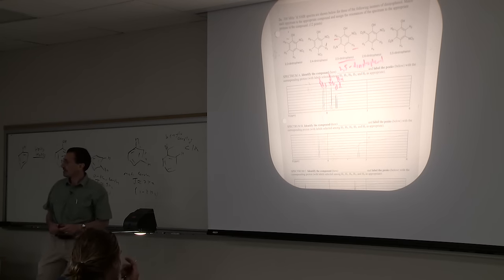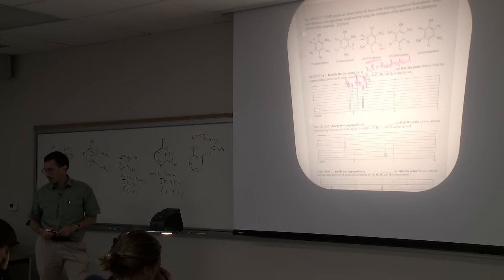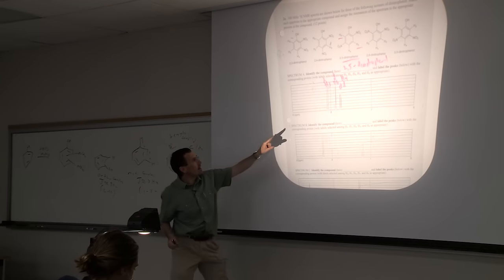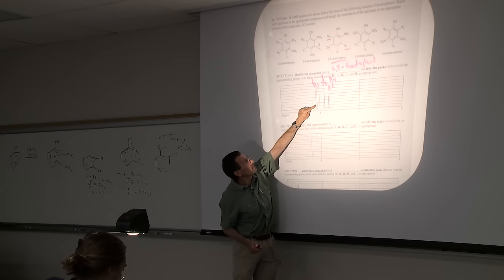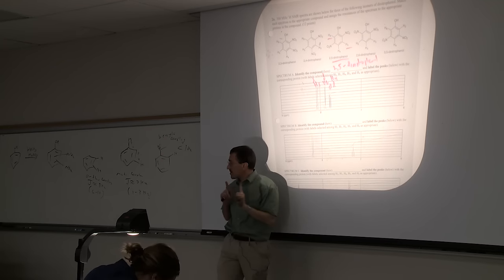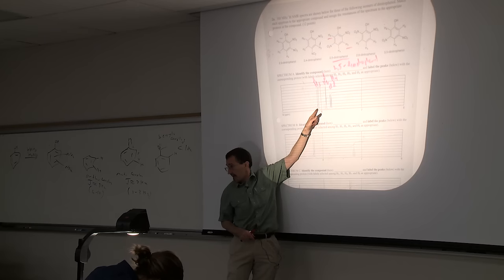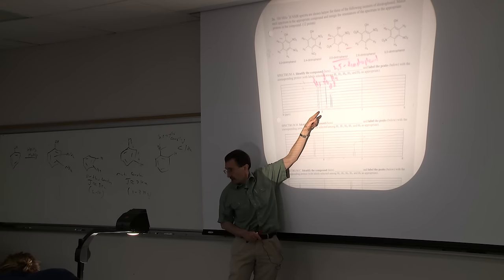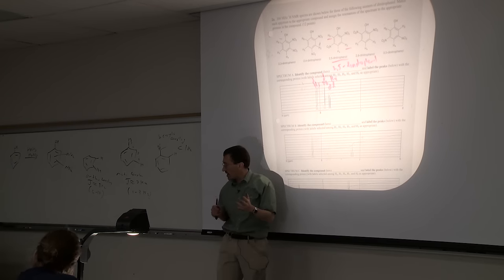Yeah. So when you say that it couples with a big J or a small J, do you look at the chemical shift between the peaks? So the coupling constant is the difference between the position of, the question is, what do I look at? I look at the position of one line, I look at the position of the other line. If I had a ruler in Hertz, I'd be able to exactly measure that difference. But that difference looks like it's not a tenth of a part per million. It looks like maybe a little less than half a tenth. Call it about 0.03 parts per million. In other words, it looks like it's about 9 Hertz.